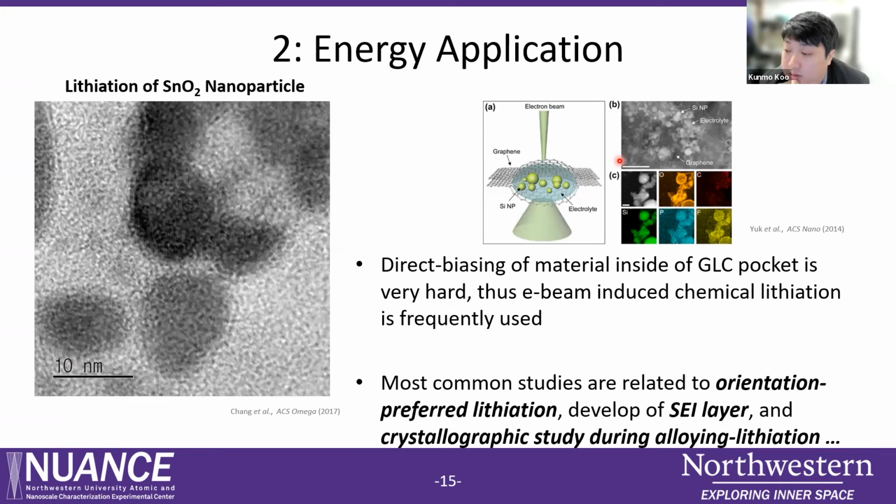So how many layers of graphene can you have at the top and the bottom? For this specific method, we are using just a single-layer graphene prepared on copper foil with the CVD method. But for other types of graphene liquid cell, which are MEMS-based, we frequently use 3 layers of graphene on the top and the bottom. We can see the diffraction and confirm that there are 3 layers on the top and 3 on the bottom. With 3 layers, the thickness would be around 1 nanometer, but there is not much effect on the resolution at that point. For more than 3 layers, currently I have no data, though other publications reported using more than 3 layers. But I think fewer than 5 layers would be okay with the graphene liquid cell.